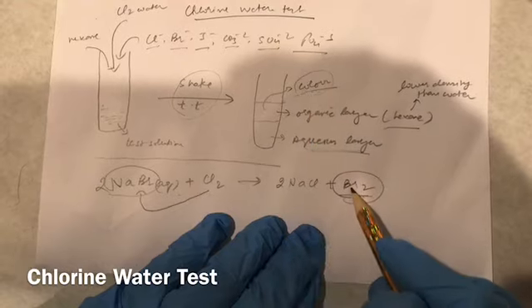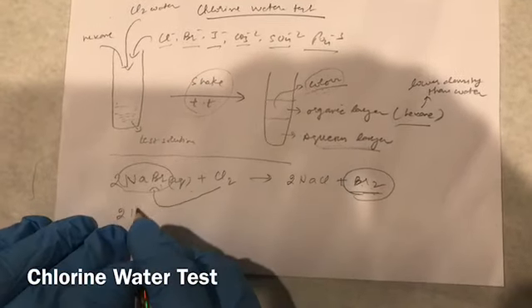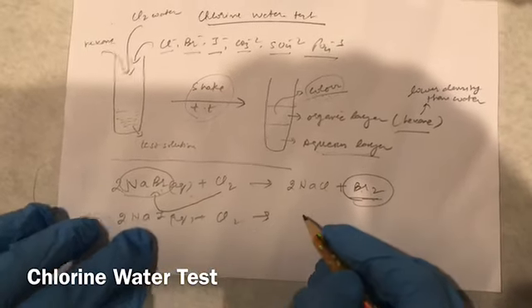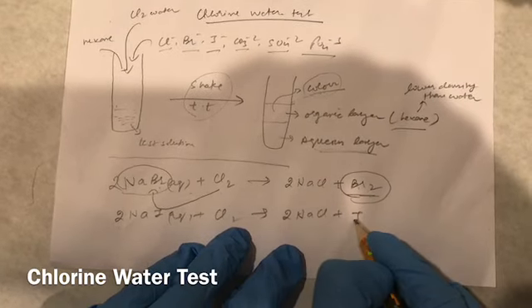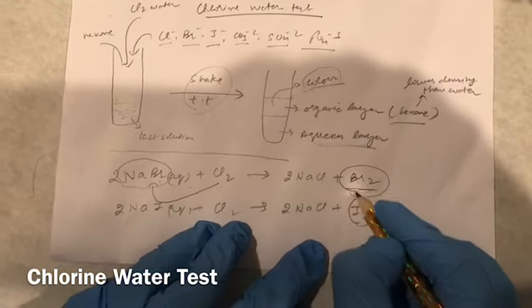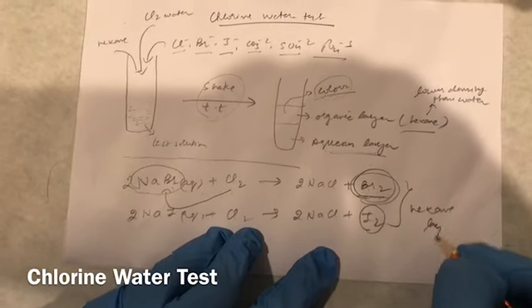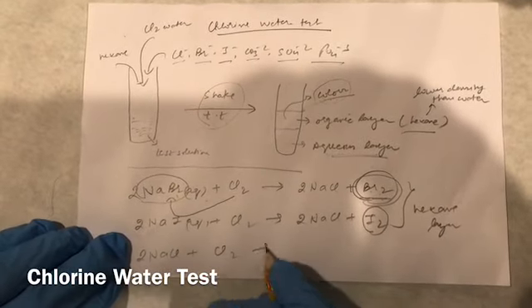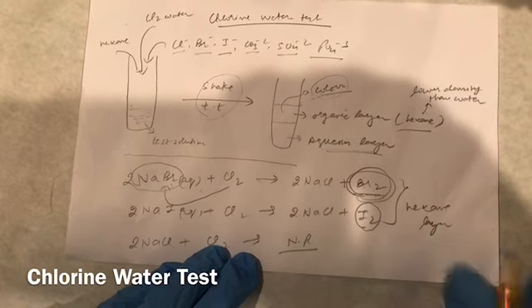So that's the test for the bromide ion. Similarly, you should see a reaction with the iodide ion, 2NaCl plus I2. Again, this I2 and this Br2 will give color in the hexane layer. You will not see any color due to chlorine, because chlorine will displace chlorine. Actually, you will see no reaction.